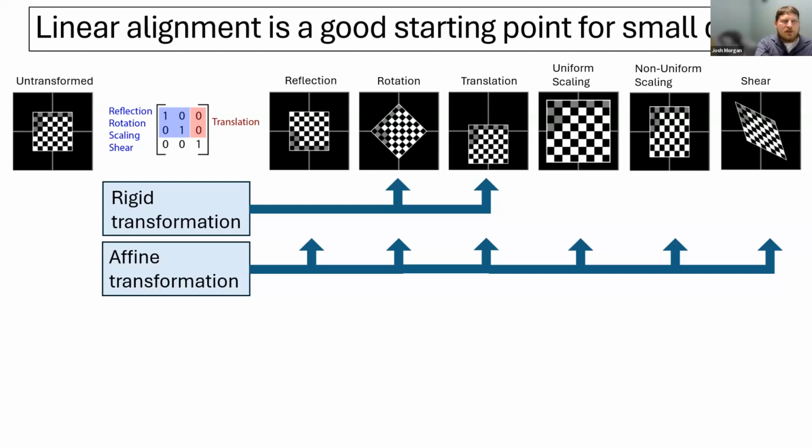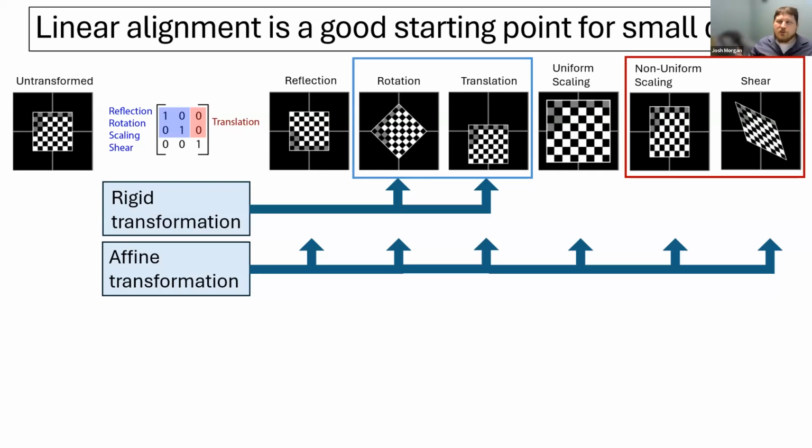So for our data sets, these different sources of transformations have different causes. Anytime you're doing automated imaging of your array, you have to deal with rotation and translation, that there might be some slight error in where the section is laying relative to the microscope. This non-uniform scaling is important for the reason I said with compression, that even under the best conditions, you might have this kind of squeezing as you do the cutting that can vary. If you can solve these two issues separately, you're more likely to have a robust solution.